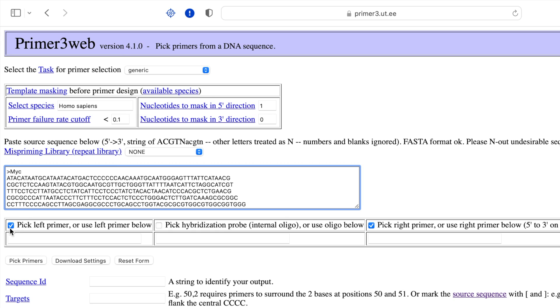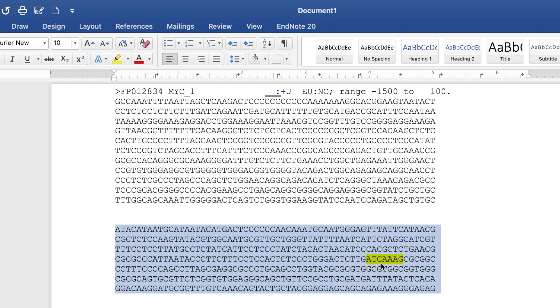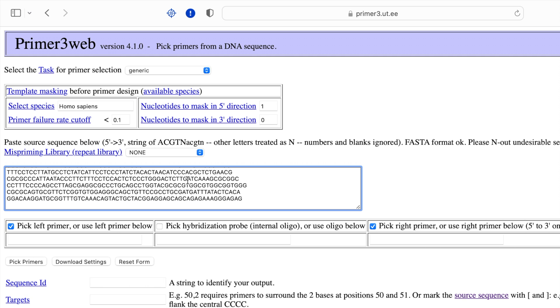Check the pick-left primer and pick-right primer options. Since the primers need to flank the specific sequence where LEF1 occupies at the promoter, let us identify and mark the sequence. To mark the specific sequence, use an open square bracket at the start of the sequence and place a closed square bracket at the end of the specific sequence.